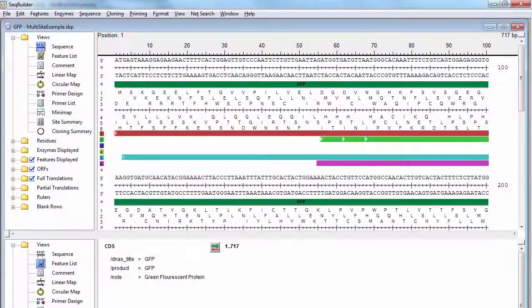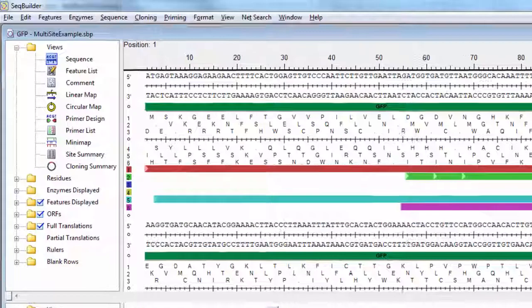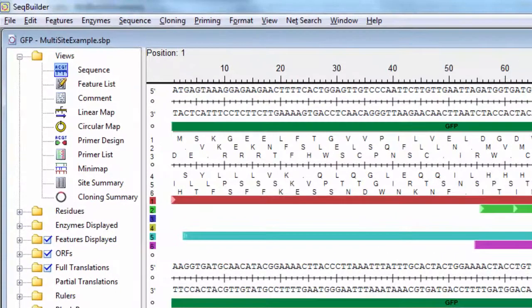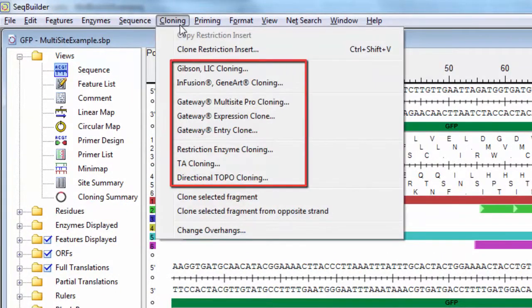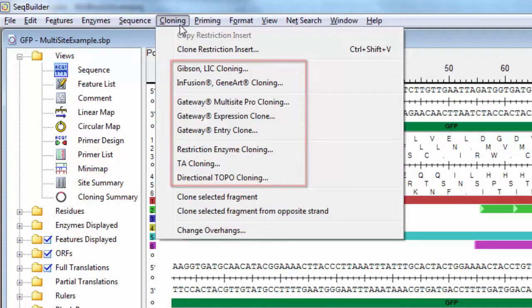With the Molecular Biology Suite, you can perform virtual cloning using a variety of cloning methods, including Gibson, Infusion, Gateway Multi-Site, TA, Topo, and Restriction Cloning.